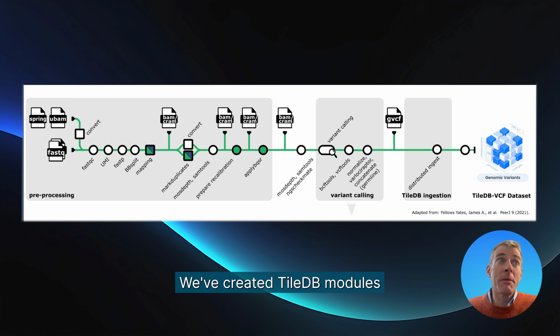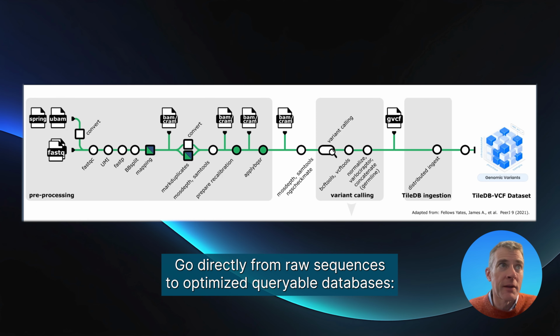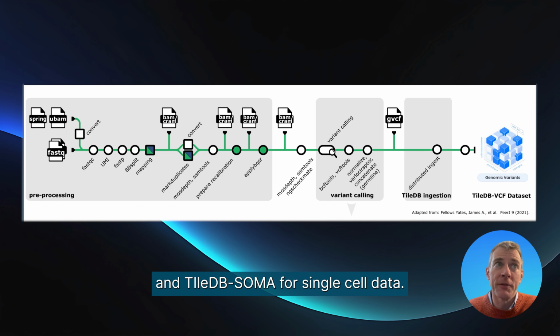We've created TileDB modules for popular NF Core pipelines like Sarek and scRNA-seq. Go directly from raw sequences to optimized queryable databases. TileDB VCF for genomic variants, and TileDB SOMA for single-cell data.